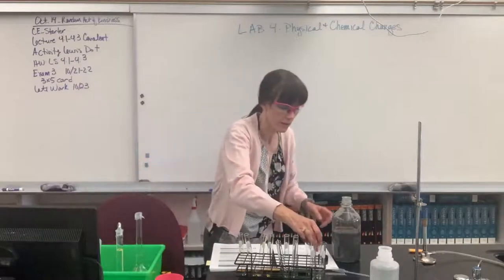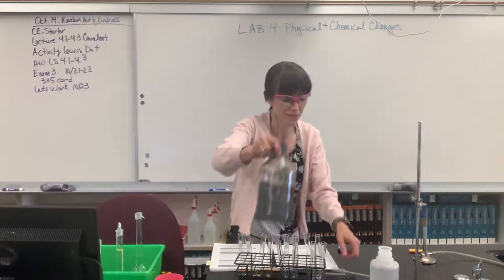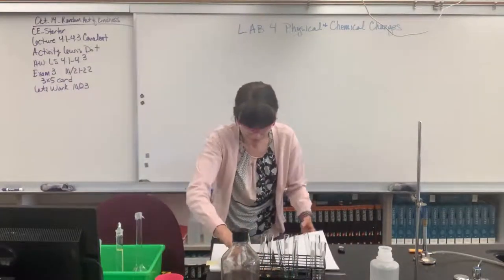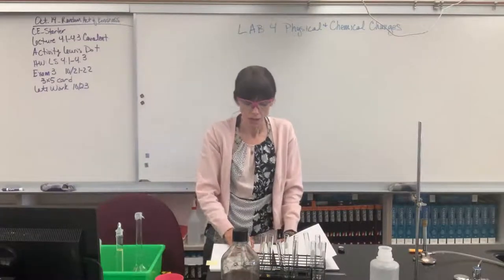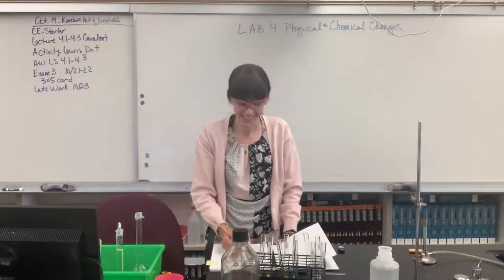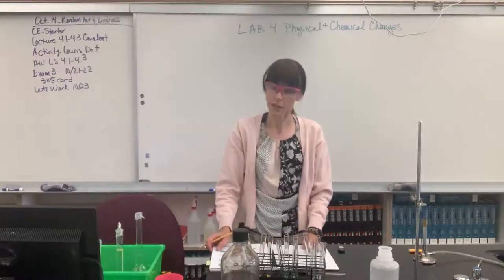Let's go back to page 53. I'm going to set my silver nitrate off to the side. There we go. And it said, result of adding silver nitrate to the dissolved sample is this white. It was a white precipitate, is what that's called. Nice. Okay, now number five.